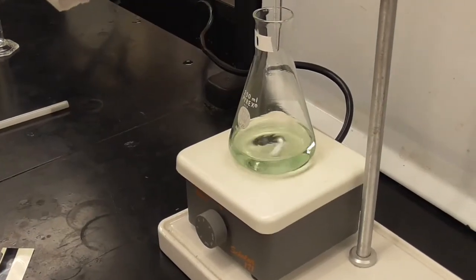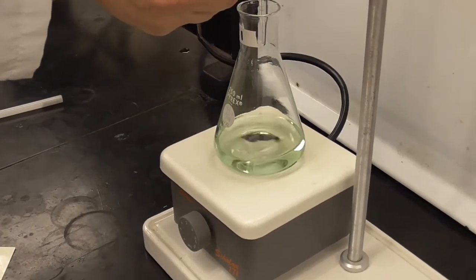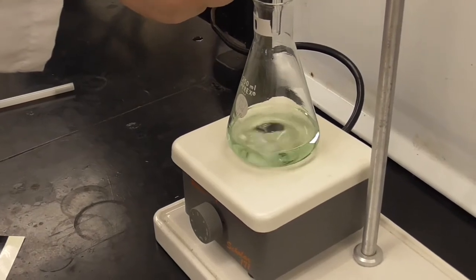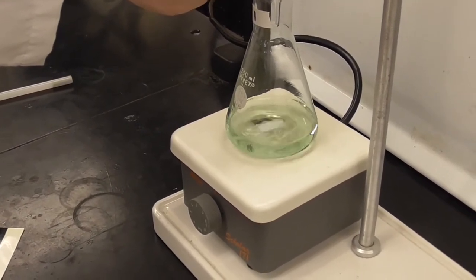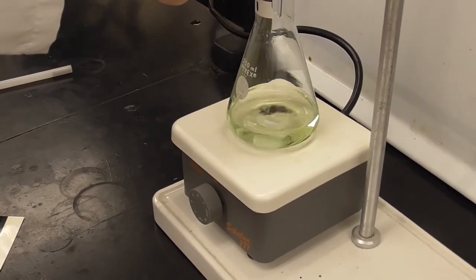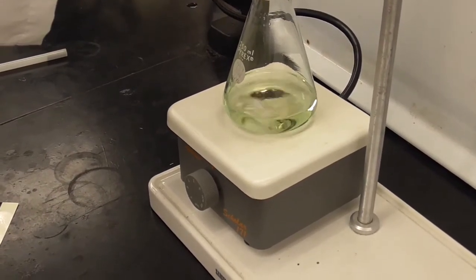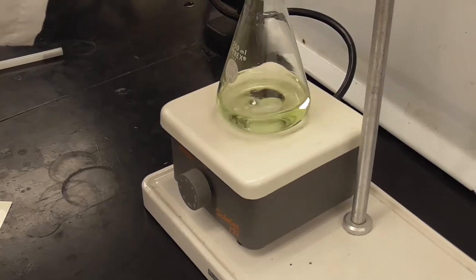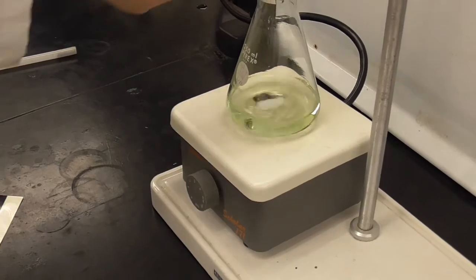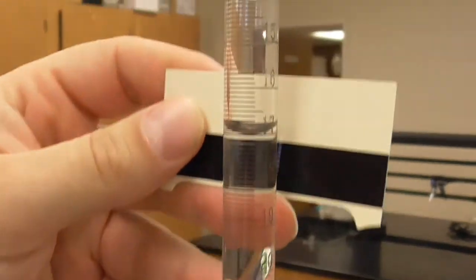Okay, so we are almost at the end point here. It has gone obviously from blue to green. And so we're just going to add a drop at a time here if we can, and see if we can get right back to that yellow that we had before. So one more drop. Okay, I think we've got it. So let's go ahead and read the burette now.